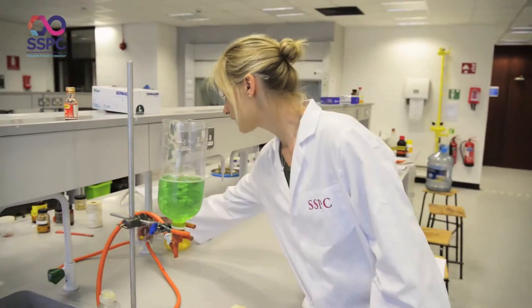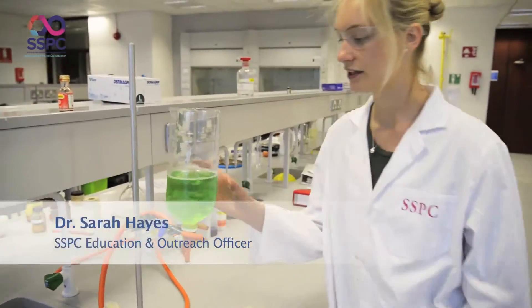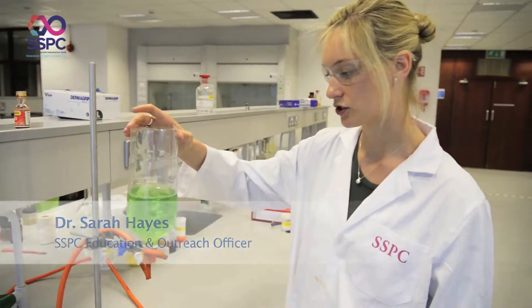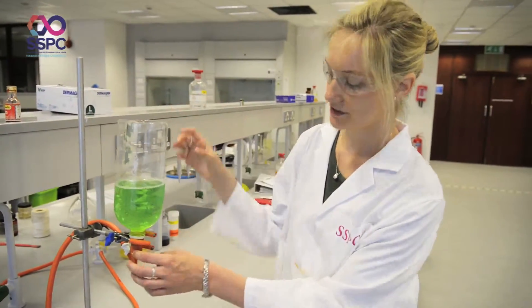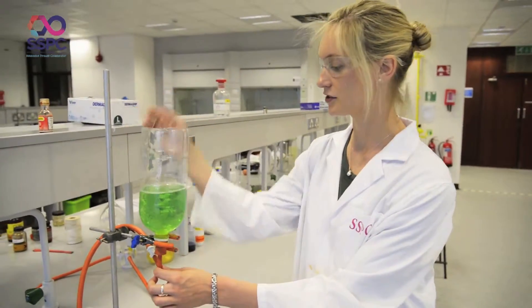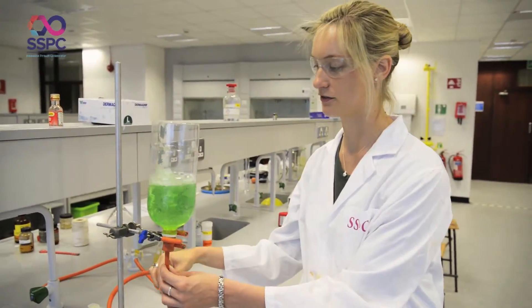This experiment is known as the Methane Mamba. What you need for it is washing up liquid and water. What I have here is an inverted drink bottle that I have stoppered, with some glass tubing and rubber connection, and I've cut the bottom off of the bottle after I've inverted it.